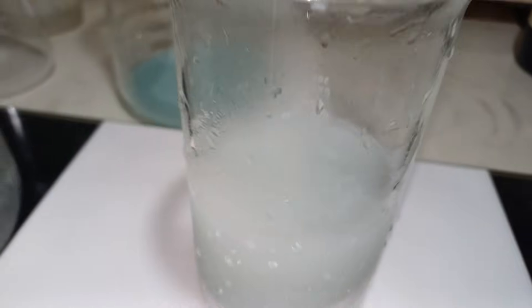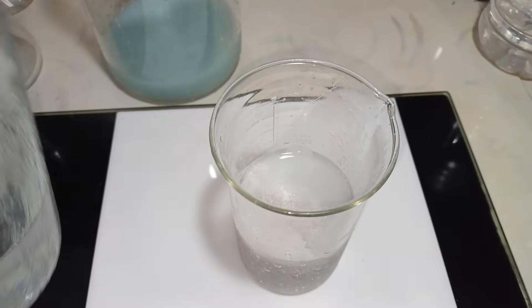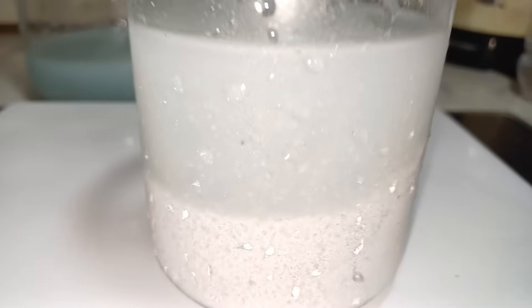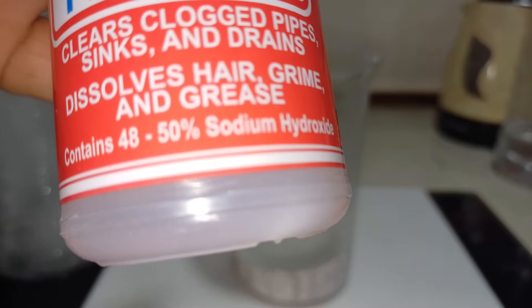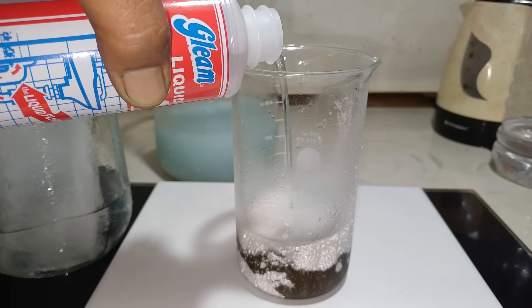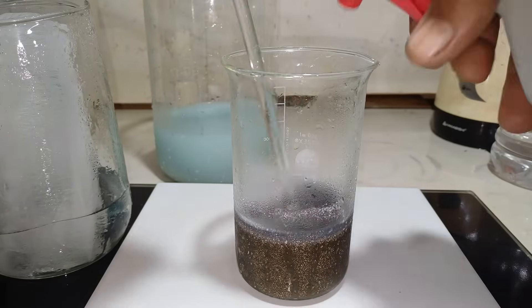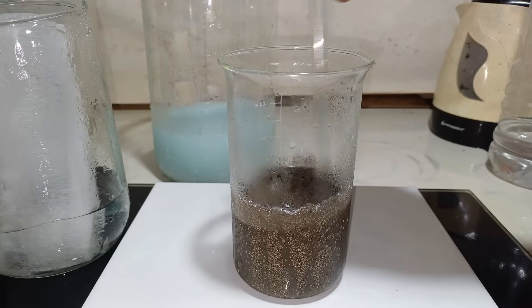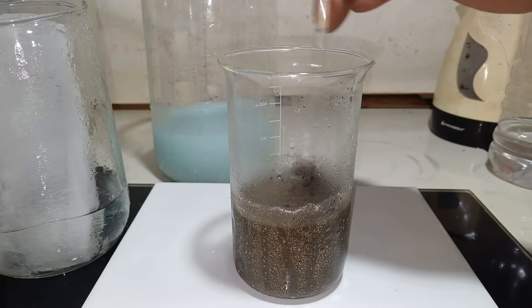We continue adding cold distilled water and always allow the silver chloride to settle. Continue adding cold distilled water until the water is colorless. Then we convert the silver chloride into silver oxide using liquid soda, which contains 48 to 49 percent sodium hydroxide. As you can see, it turns to black. We stir very well — this takes some time. The indication is that all the silver chloride turns black.